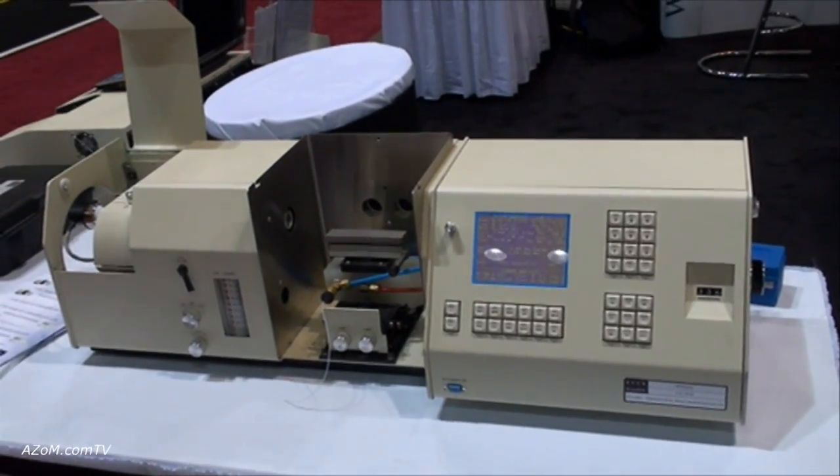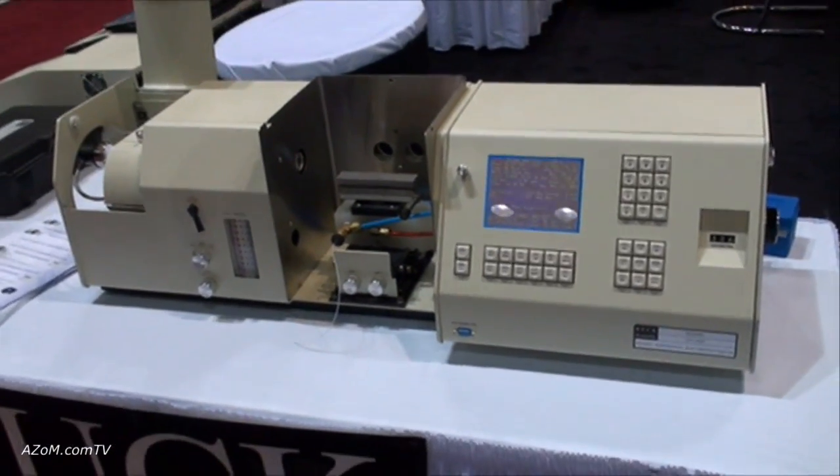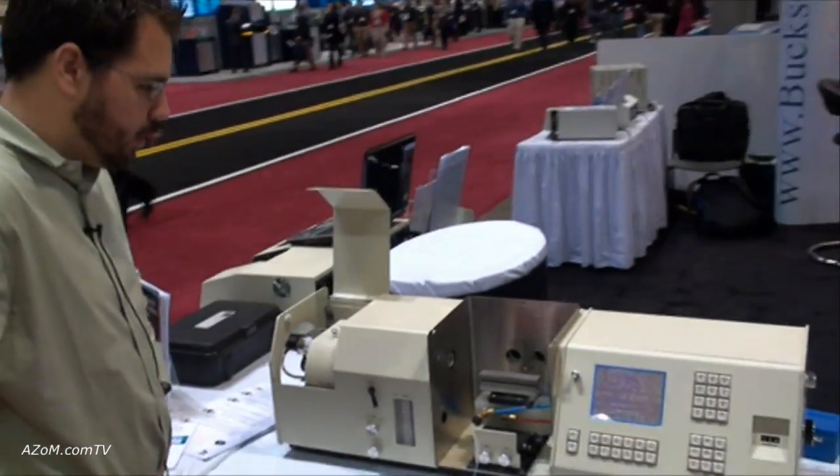So it's a fairly rugged sort of machine that's good for quality control — that type of application? Absolutely. Teaching and quality control are very good applications.